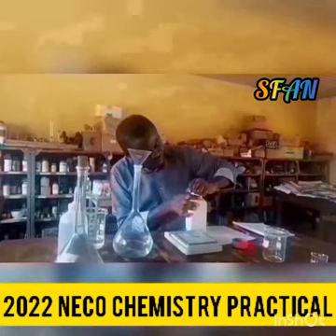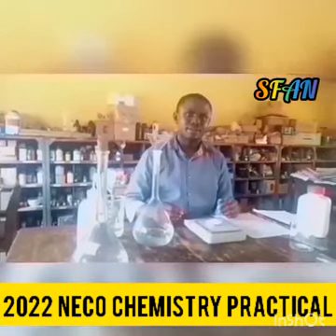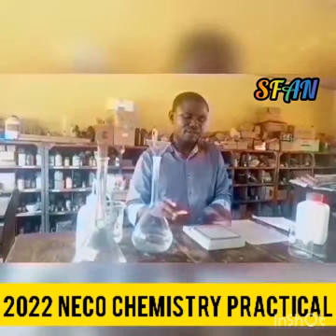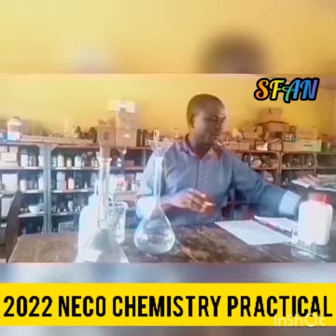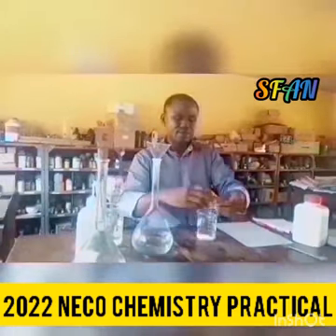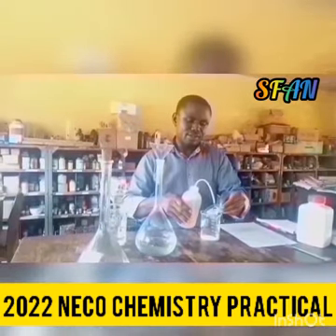Okay, so we have weighed out our 4.2 grams, and we are going to transfer it into this beaker, and dissolve it in distilled water.